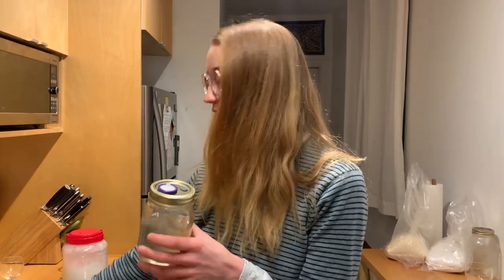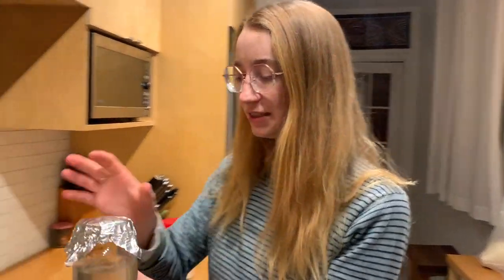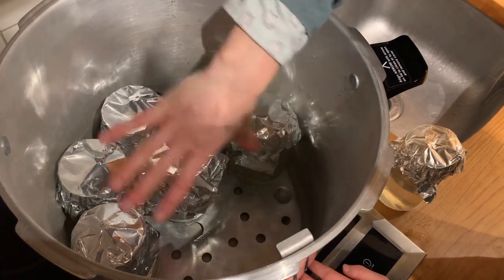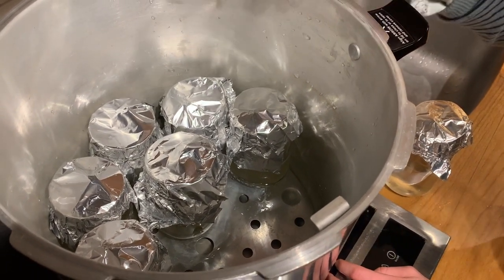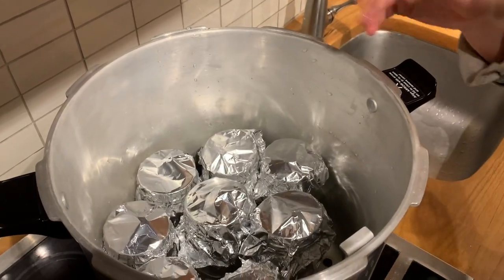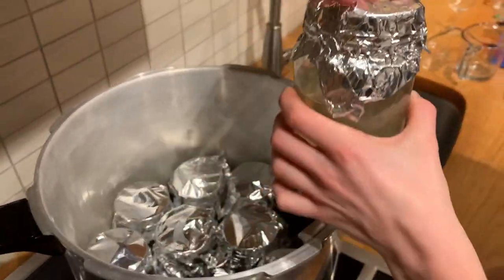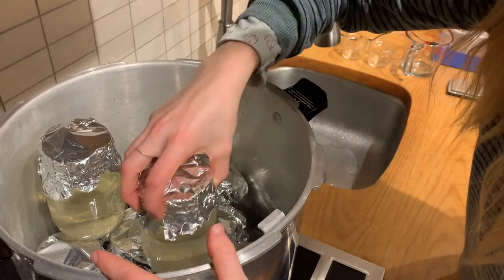Once you have all your jars ready, put aluminum foil over the top of them so that water doesn't get into the syringe filter, then place them in your pressure cooker. Many pressure cookers come with a tray at the bottom to elevate the jars and keep direct heat off them. You'll need to put about an inch of water in — be aware the water level will rise as you add jars. Since we're doing liquid culture with syringe filters, we don't want water getting into the filters, so keep all jars upright.